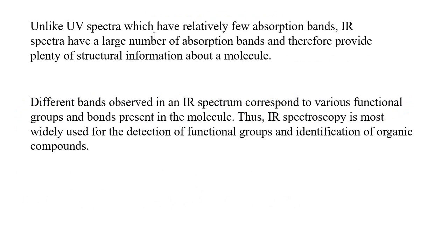Okay, see, unlike UV spectra which have relatively few absorption bands, IR spectra have a large number of absorption bands compared to UV spectra, and therefore provide plenty of structural information about a molecule.